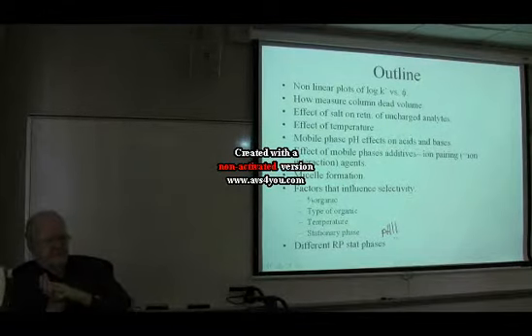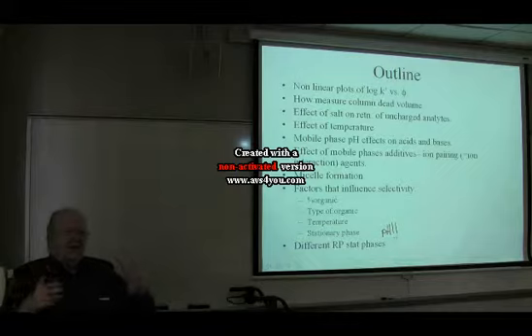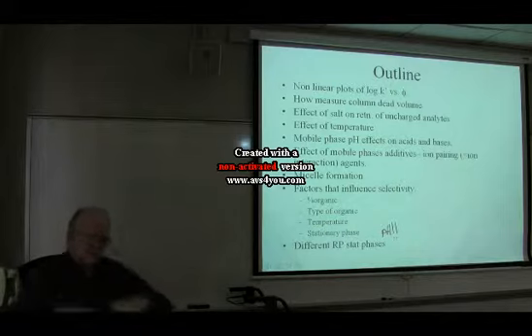...to increases in retention and factors that lead to decreases in retention. And if you only remember one thing: anything that enhances the water solubility of a solute, any functional group that makes it more soluble in water, will lower its retention in reverse phase chromatography. So really polar functional groups, and especially functional groups that are very, very good hydrogen bond acceptors and donors, will really enhance water solubility and have a big effect on retention, and will lower retention a lot.